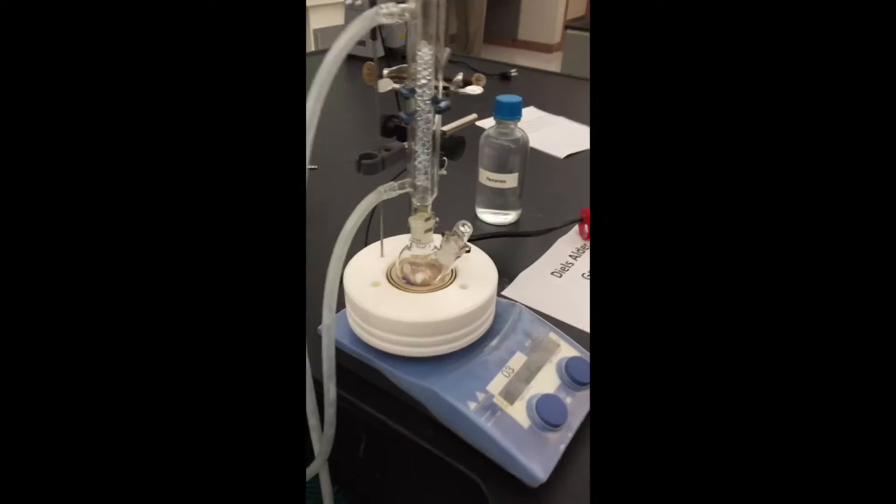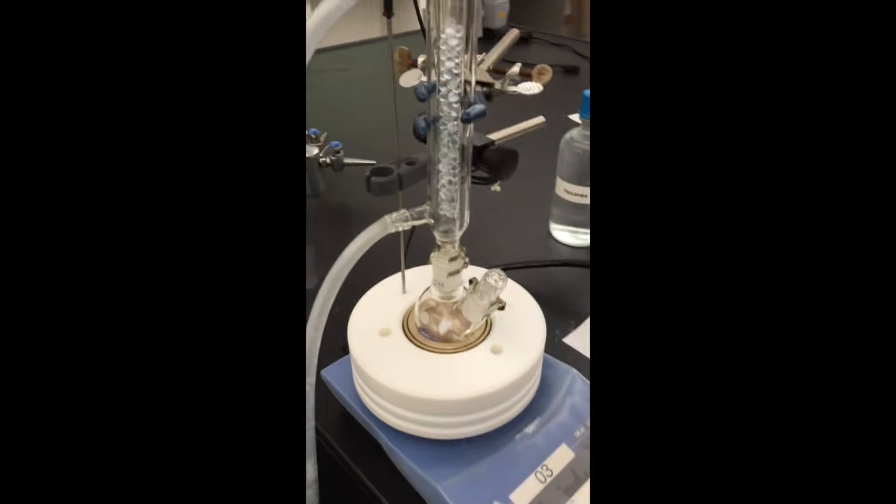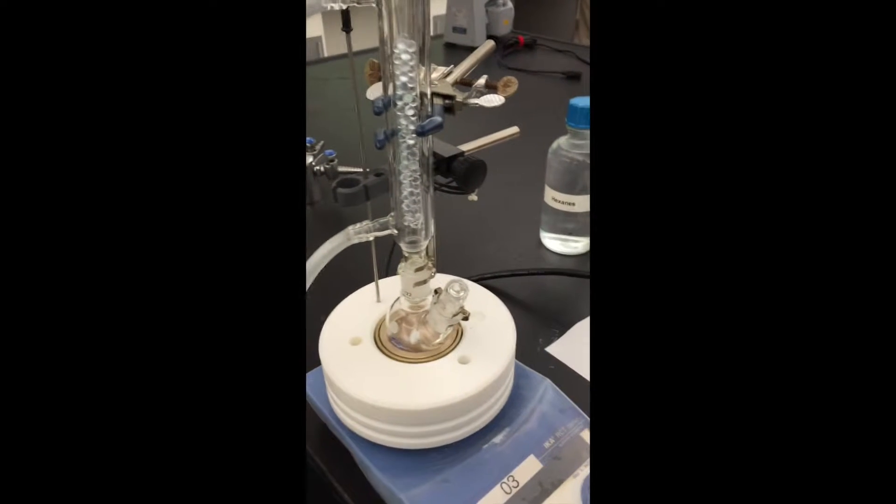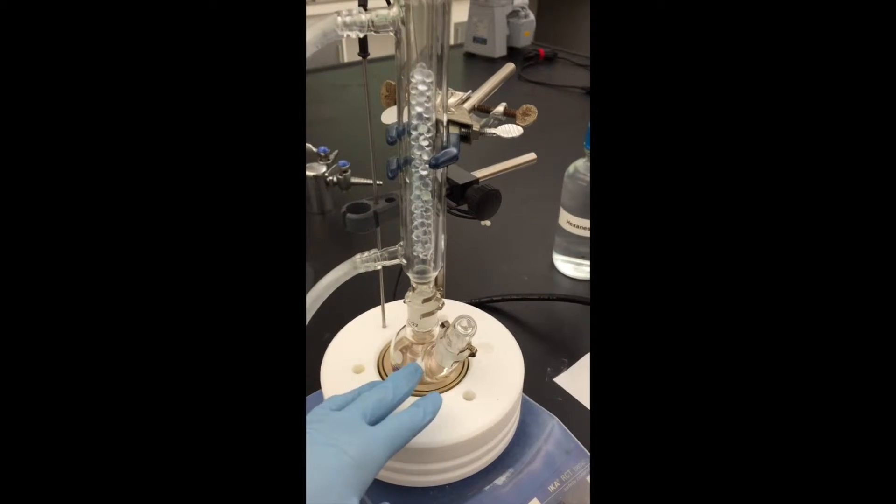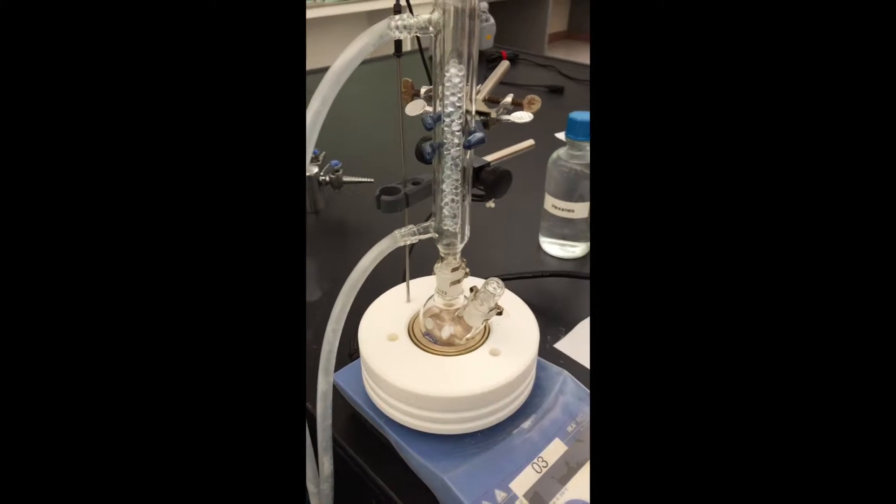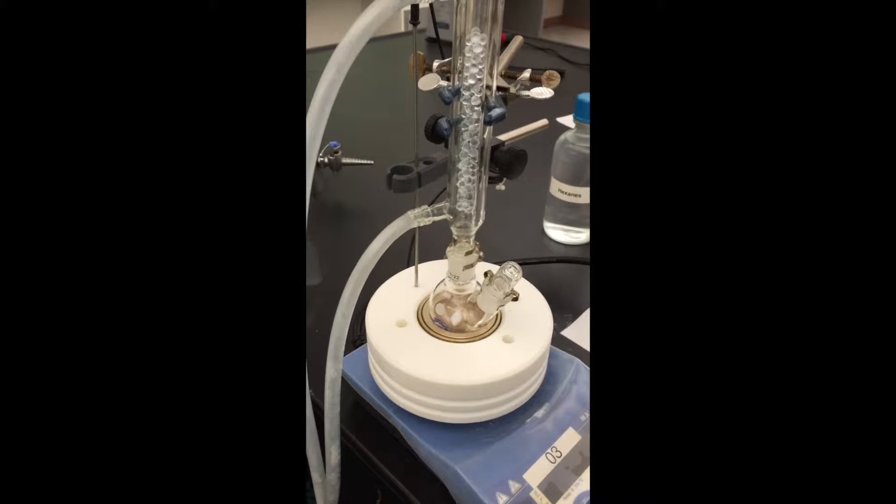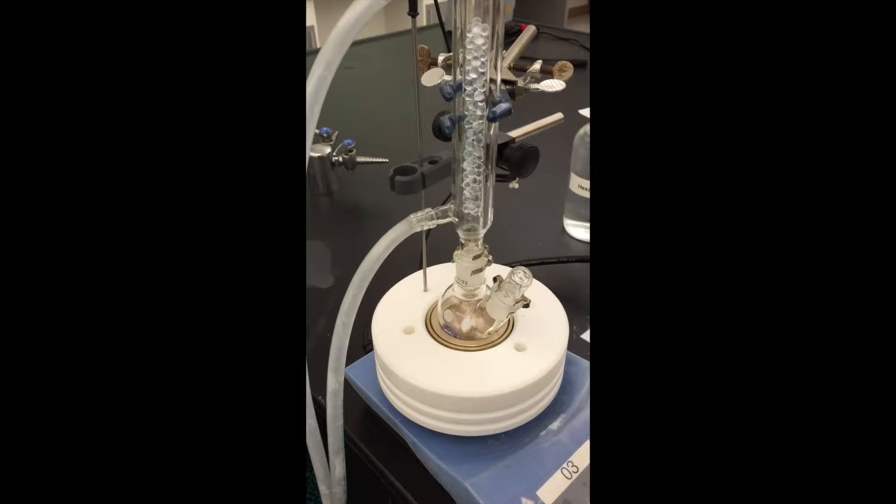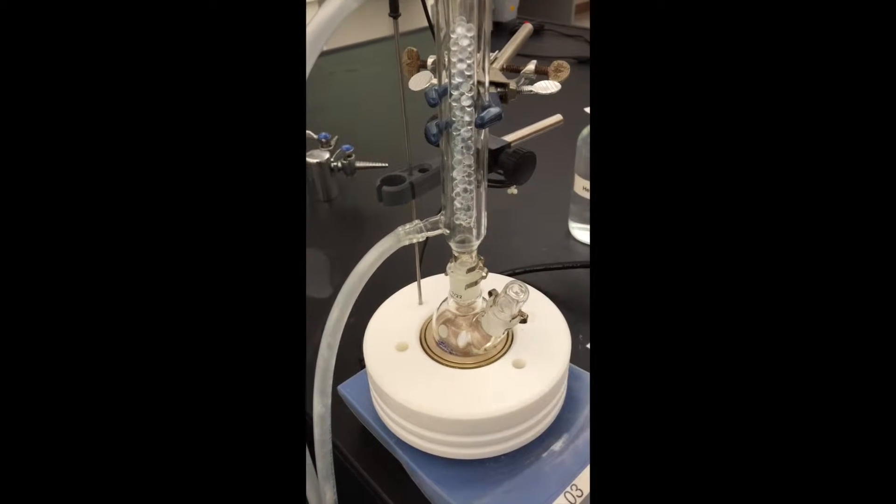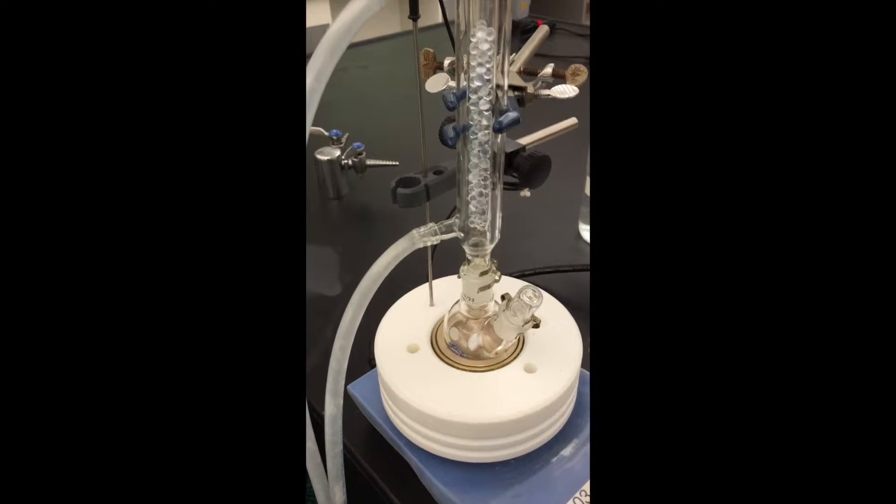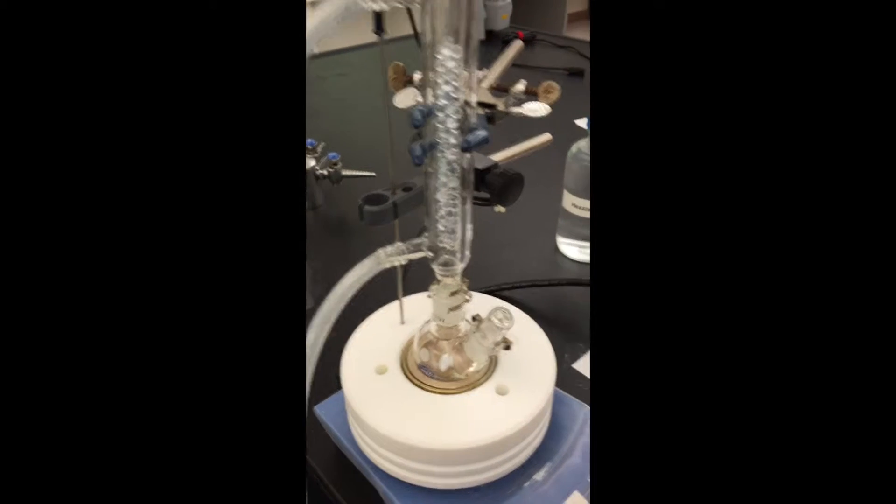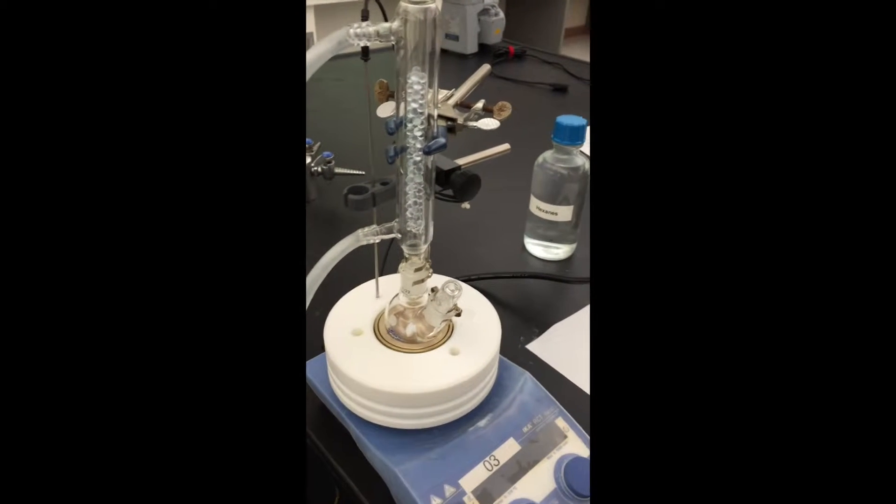And we are going to hook it up to a cool reflux condenser. Combine everything down here on the bottom. And we are going to mix and reflux for one hour. The reaction block set at 250 degrees Celsius to dissolve the solid as the reaction progresses. So here we go.